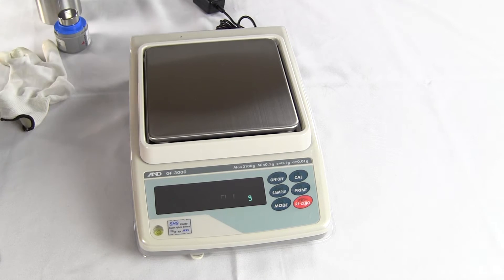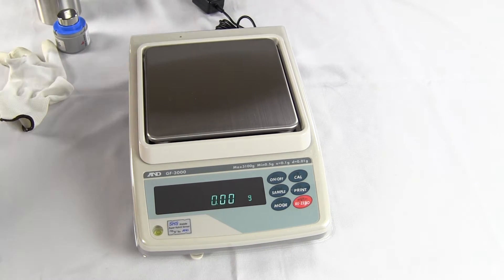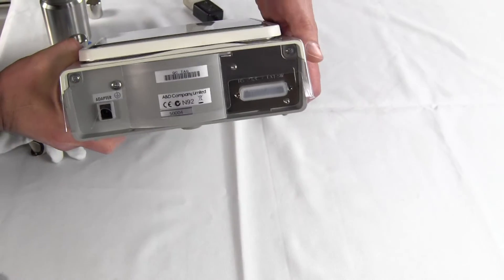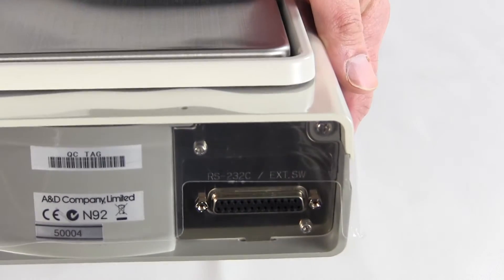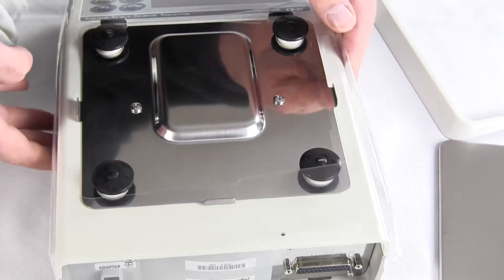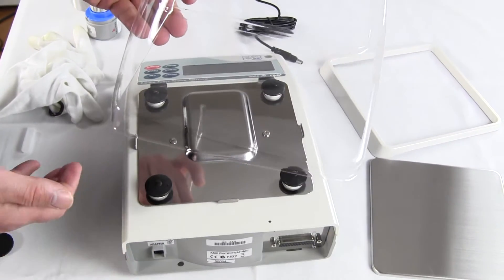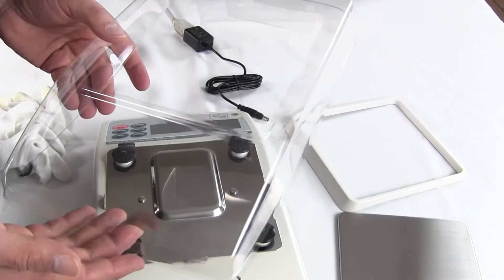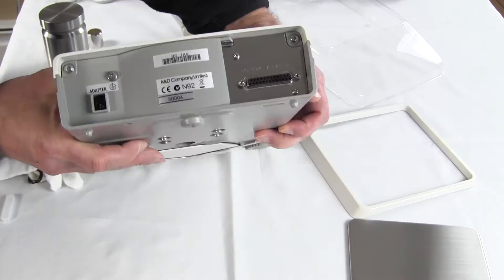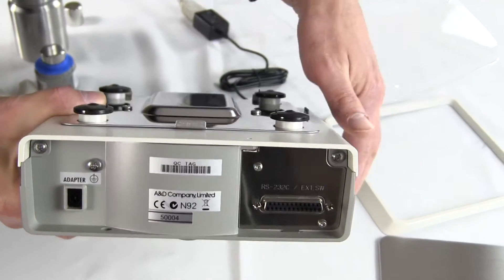There's also the GX series, which has motorized internal calibration. On the rear of the balance we have an RS-232 interface — it's 25-pin — and you can plug into the A&D printer or send data to a PC. The balance also has a splash shield, so if you ever have any drips you don't ruin your balance. They sell extra ones for about $20, but you get one when you buy the GF series. On the rear you'll see the power connection and the RS-232 port.